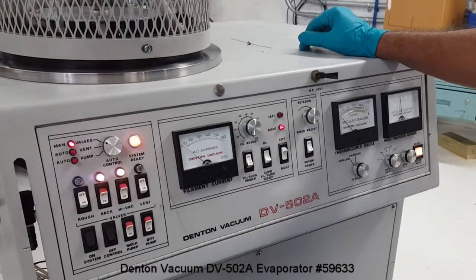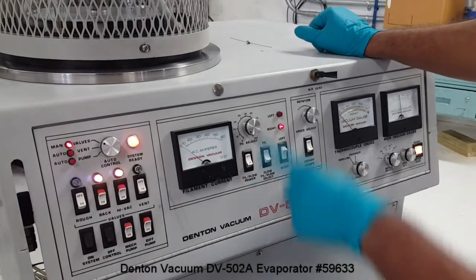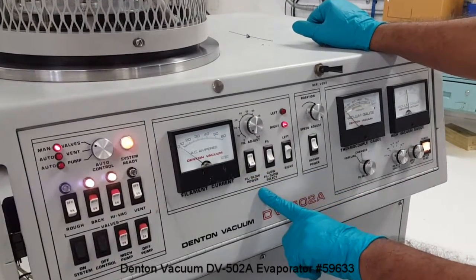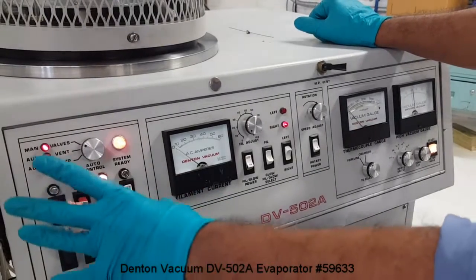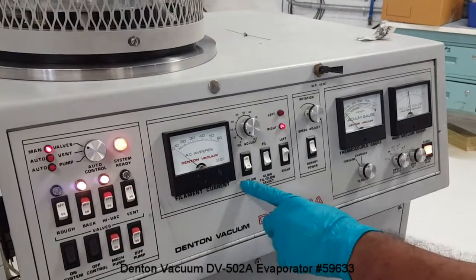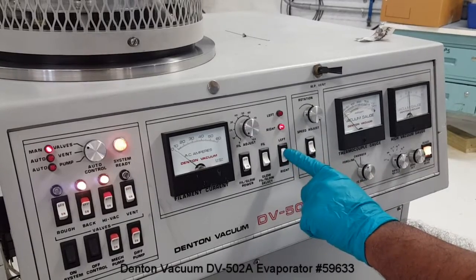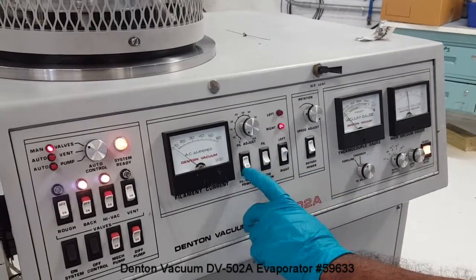Denton TV 502A, the thermal evaporator. The thermal evaporator is set up with two filaments. The system can be operated using the switches here for the vacuum cycling. You can select either the right filament or the left filament and turn it on.